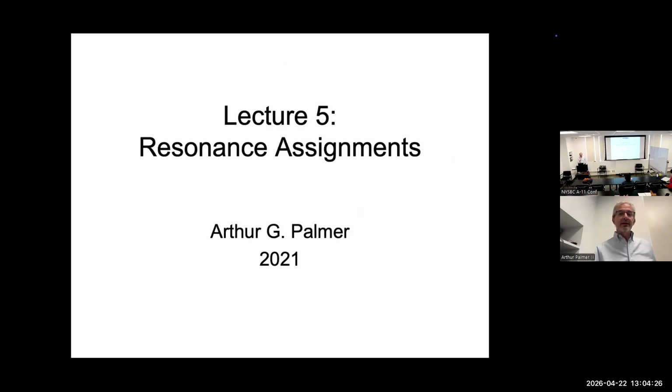Today I'm going to talk about how one does resonance assignments in proteins. This will be kind of a walk through pulse sequences in some way. And then at 2 o'clock, Bruce Johnson is going to do a demo/tutorial of his software, which is called NMRFx Analyst. That, of course, is one of the software packages that you can process and then analyze NMR data in.